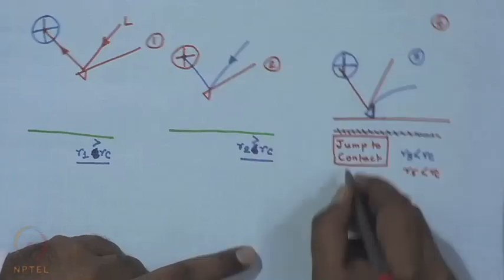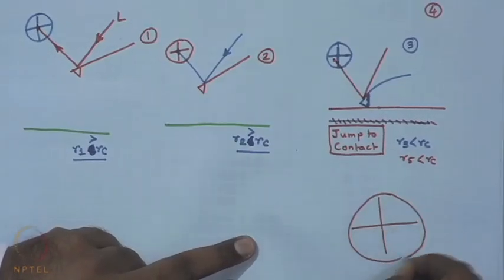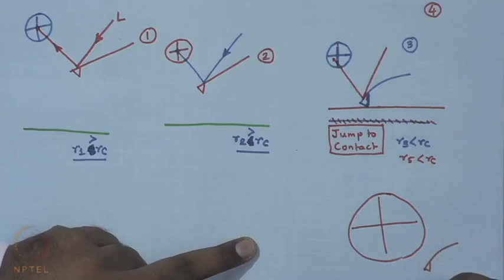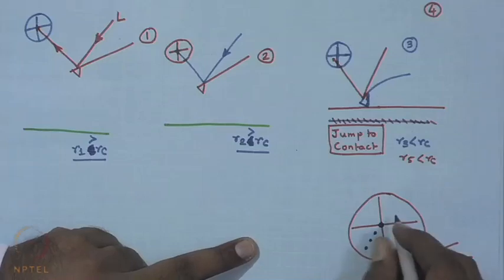Attraction increases means that progressively the cantilever deforms more and more, and consequently from here, this was the location of the aligned one. As the attraction increases, the laser light drifts more and more from the center.